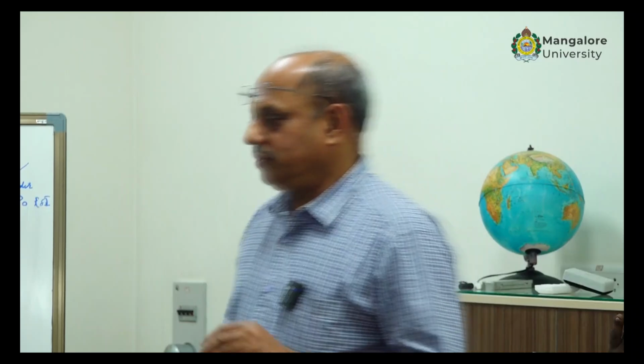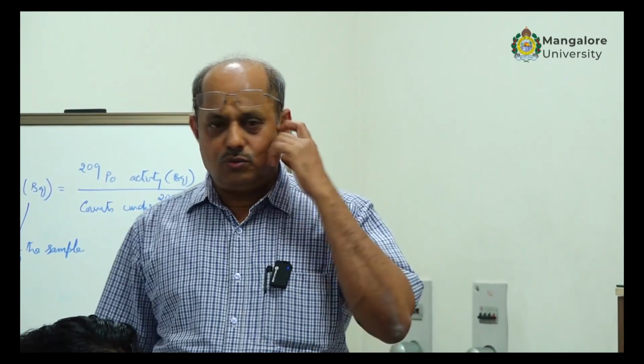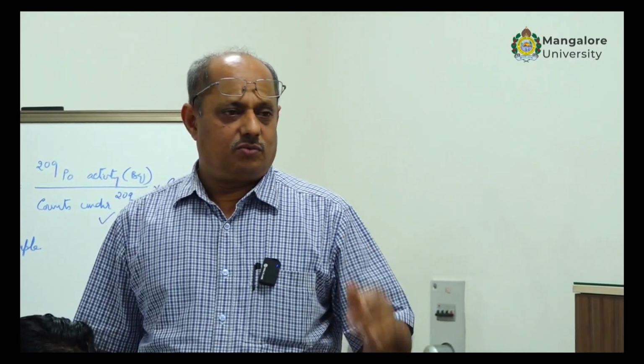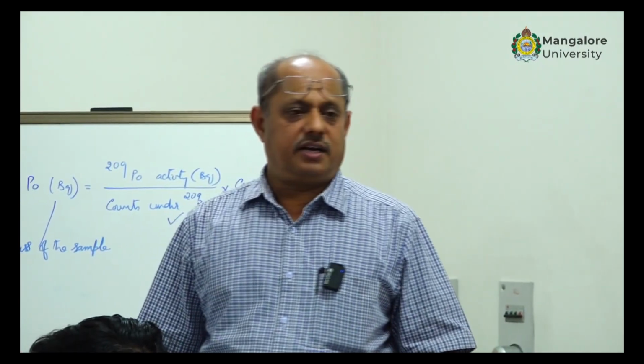And tomorrow if you want to spend time with the sodium iodide, you can do that. Otherwise, we can give you reference materials in various geometries, and samples in various geometries. You count the sample, you determine the activity. Okay. The target is that on Saturday, if I give some sample, you should be able to report the activity of the various radionuclides.